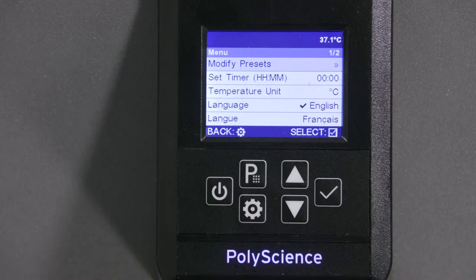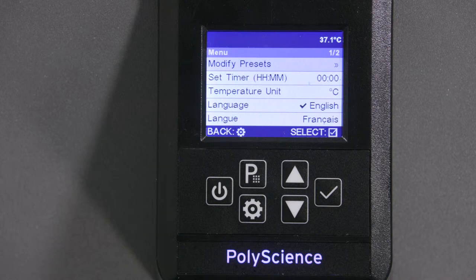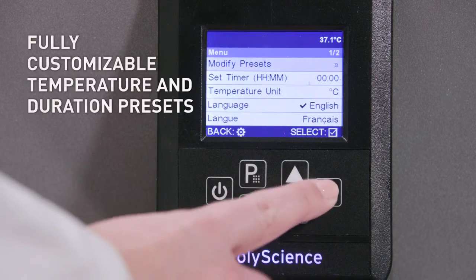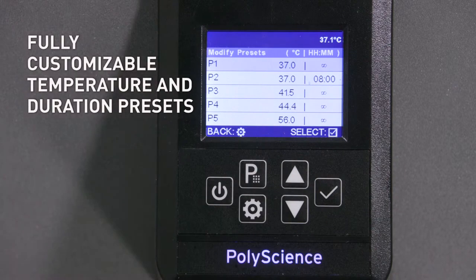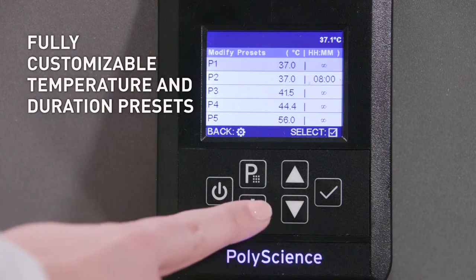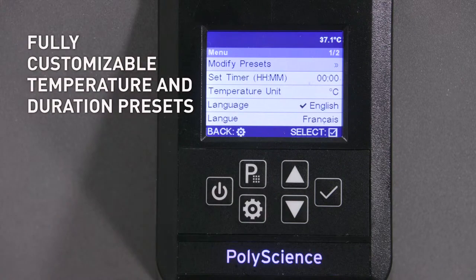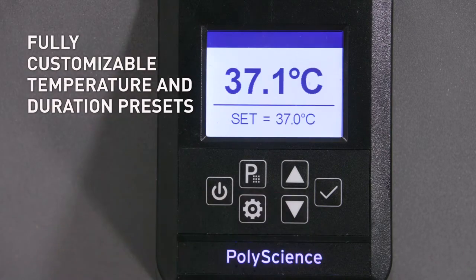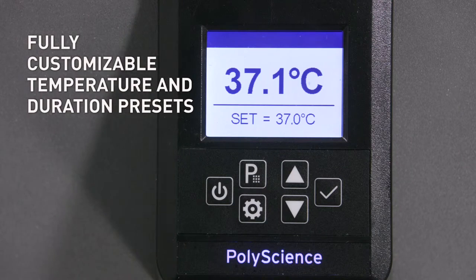Our new general purpose water baths feature intelligent, fully customized temperature and duration presets, giving you the ability to program frequently used values that are repeatable at the press of a button.